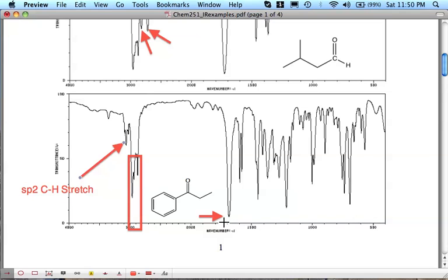And again, if it's a lot above 1700, for example, closer up to 1800, it might mean a small ring. We'll see an example of that. A couple other things I want to point out that you can look for that are very distinctive for the aromatic ring are, of course, all these C double bond Cs in the ring. Now, of course, if we drew a resonance form, there would be C double bond Cs in the alternating positions, so maybe you could say they're C 1.5s or something as opposed to doubles.